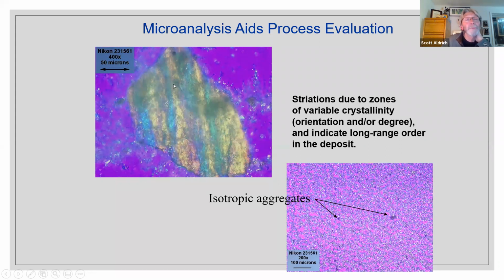And so we would want to try to avoid this in the machining or micronizing of a drug. And in this image in the bottom right, we're looking at aggregates within an array of a normal drug, and we find that even though the quantity is really low, that's objectionable too. It'll affect the processing.